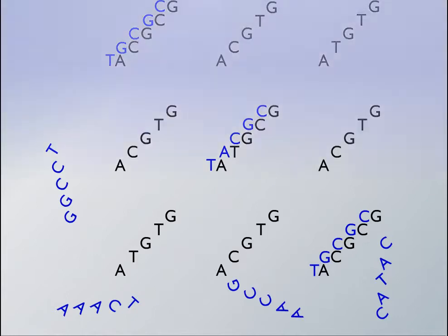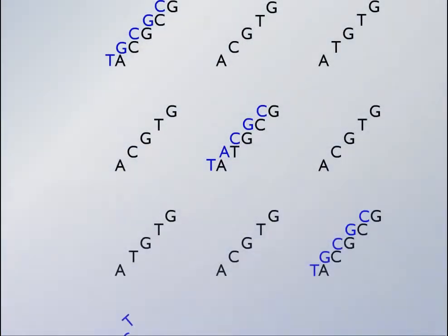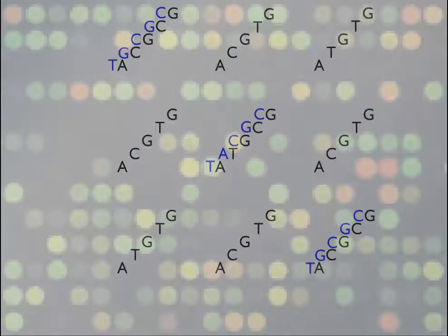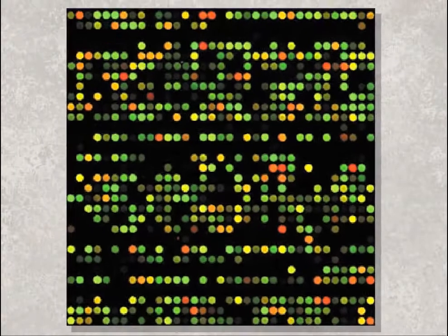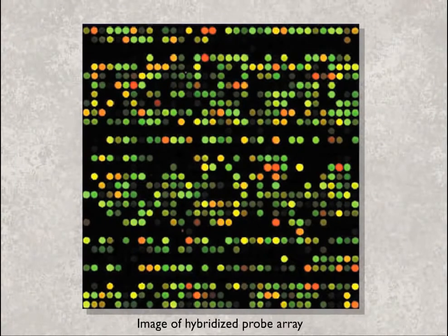The surface of the microarray is then scanned with a laser beam, and the data obtained is used to produce a visible image. Color intensity indicates the extent of hybridization to the different probes. Over 200,000 probes can be constructed on a single microarray. With this technology, any desired sequence of nucleotides can be constructed to form a probe.